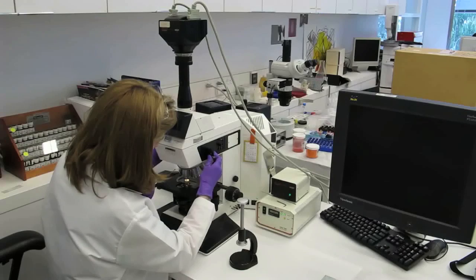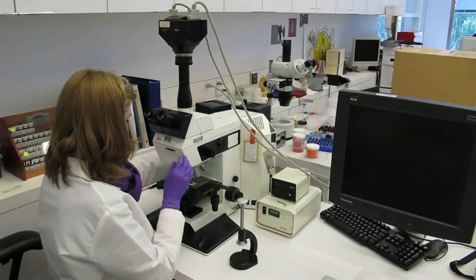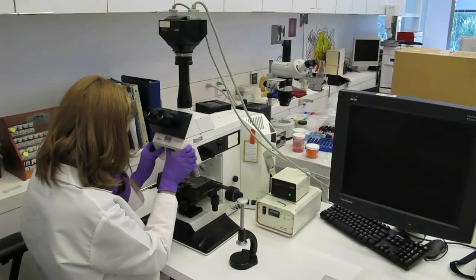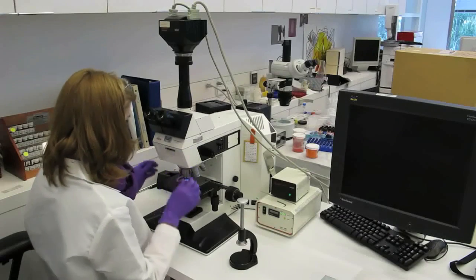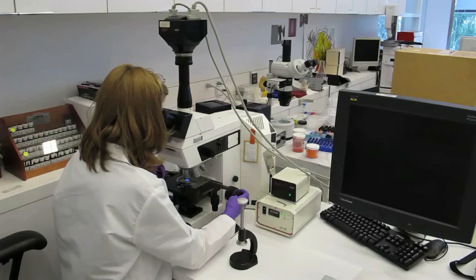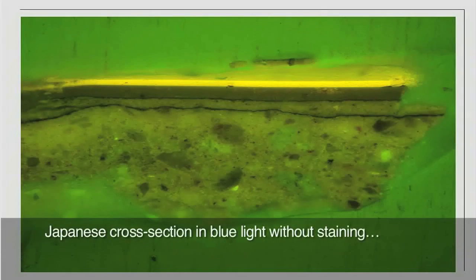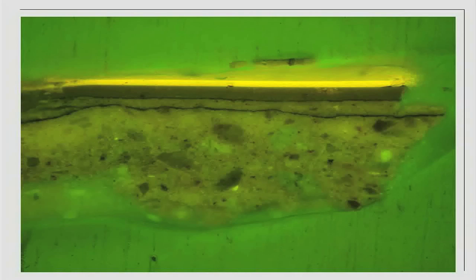As Asian lacquer coatings contain components that have a characteristic fluorescence under incident blue light, the light source and filter cubes are changed in the microscope so that the sample can be examined under fluorescent conditions. This image shows the same sample as before in blue light, where the multilayered structure of the top lacquer layers and the foundation becomes even more apparent.